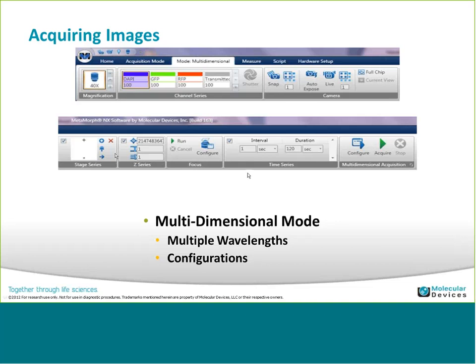So you're setting just a single illumination setting for the acquisition. You can open the shutter, snap the image, or do a live, so your camera controls are there, as well as your chip area, so full chip, or you click create a rectangle region, and you'll be able to put a region on the active image and then use current region to do a subregion.